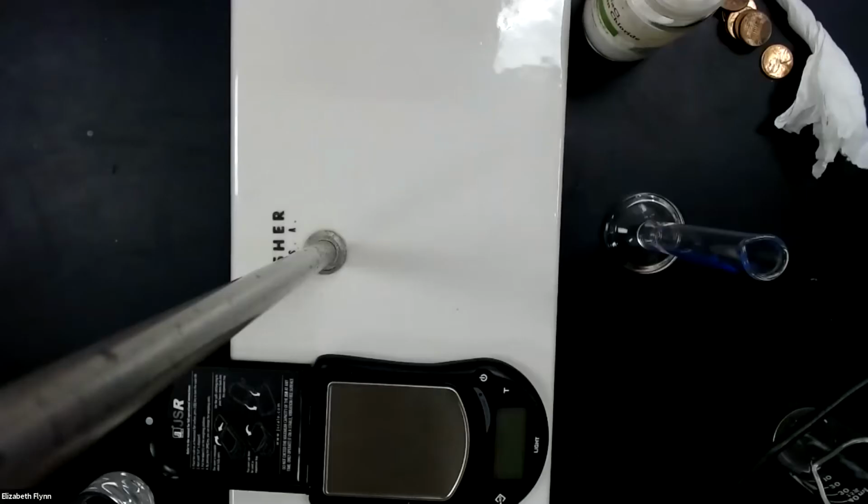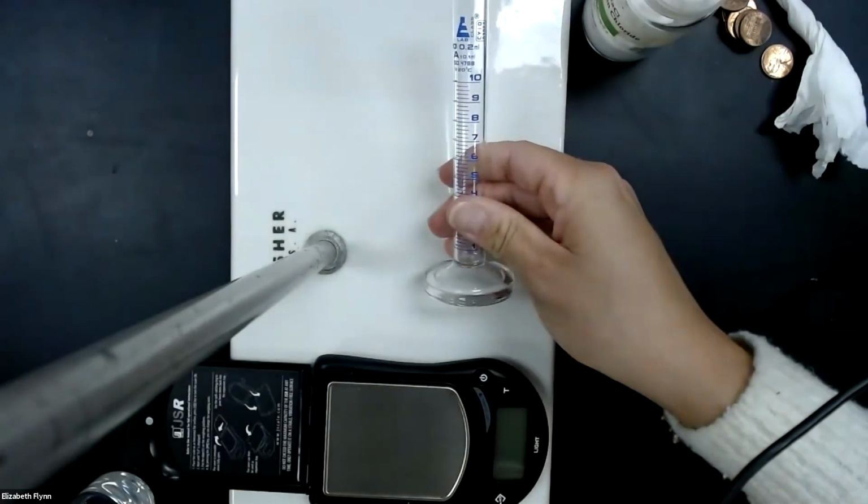There we go. Actually, turn this around. Okay, I've got it focused. And again, we got our dry graduated cylinder.